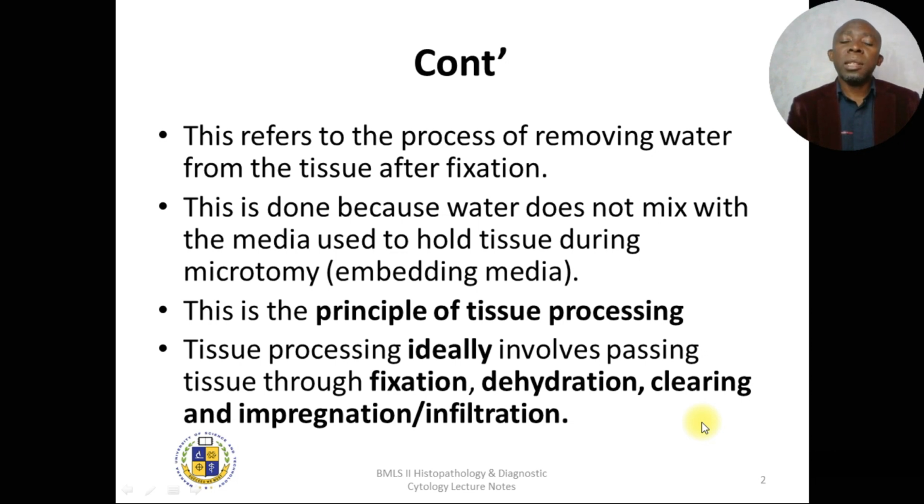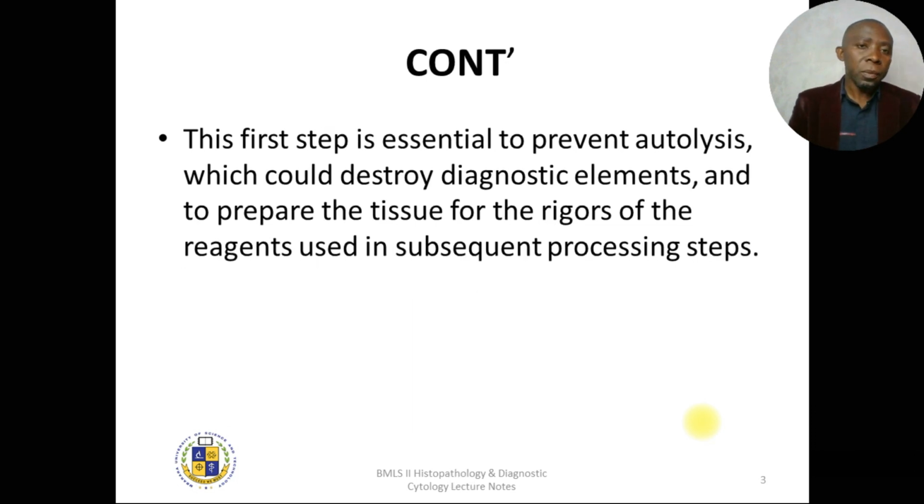Whether you're going to process the sample using automatic processors or manual processors, the principle or the procedure will always remain the same. It will always start with fixation, followed by dehydration, clearing, and then impregnation. And all these have different purposes, just like we mentioned before.